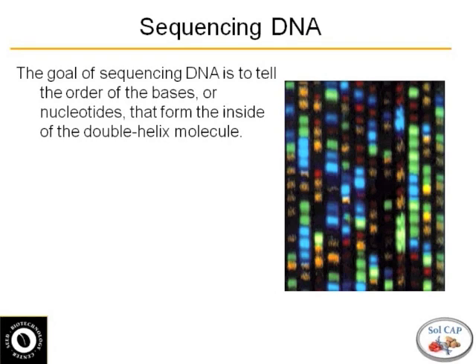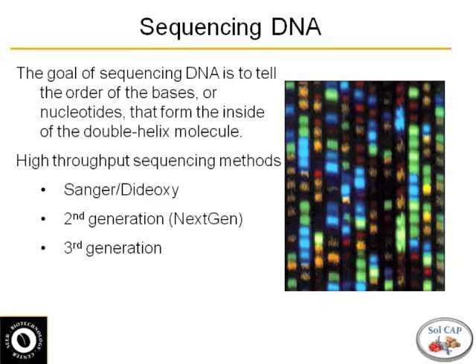With sequencing, unfortunately we don't have a technology right now that can basically take a DNA molecule and sequence it from one end to the other. So basically what we end up doing is we chop up the DNA and we try to put it back together. That has some issues and different technologies handle that in different ways.